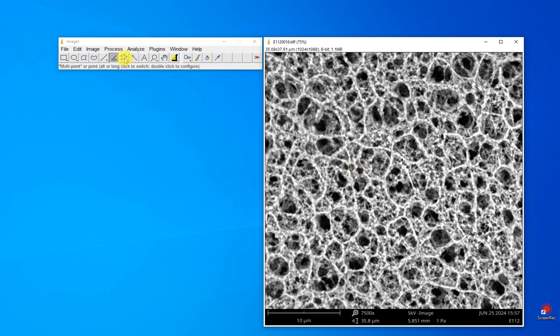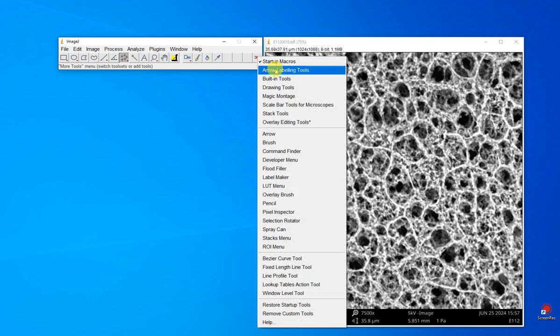So these are some other tools. Multiple points, you can also change to point tools, and this is another tool, and you can even type the text, choose the color, and there are many tools. Here you can also select this arrow and use some other functions as well.